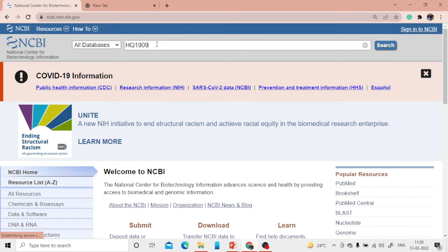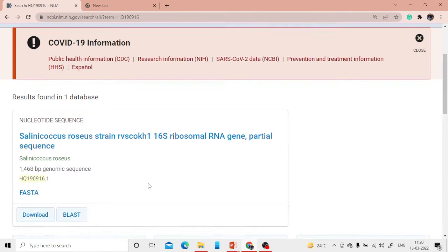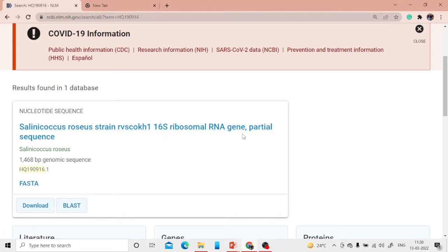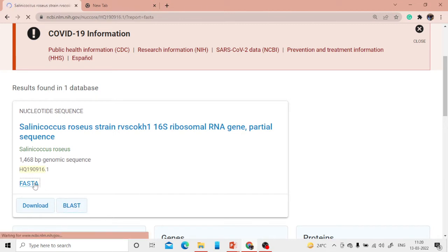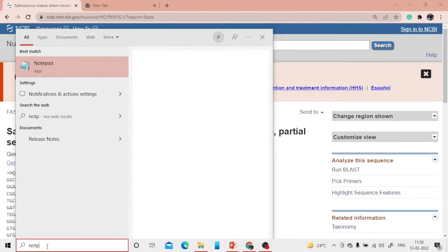The sequence accession number is HQ190916, deposited in NCBI. This is Salinicoccus roseus, strain RVSCOKH1, and it is a 16S ribosomal RNA gene — meaning it's DNA. Let me retrieve the FASTA sequence and open Notepad to copy and paste it in FASTA format.